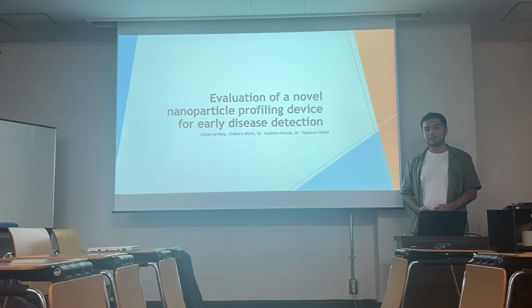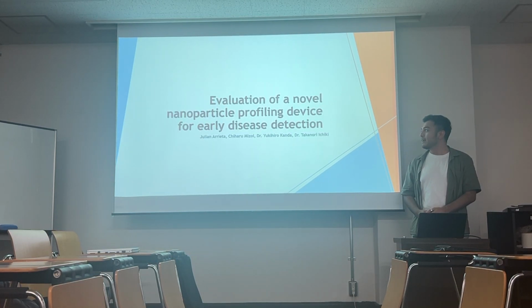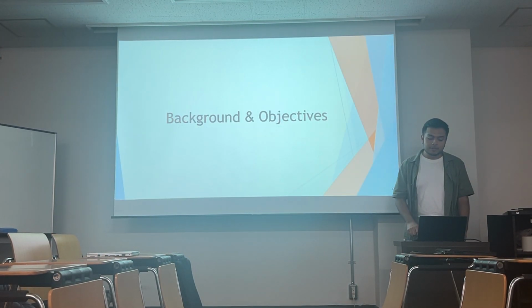Over the past 9 weeks, I've been working on this project focusing on the EX400, evaluation of a novel nanoparticle profiling device for early disease detection. A little bit of background.